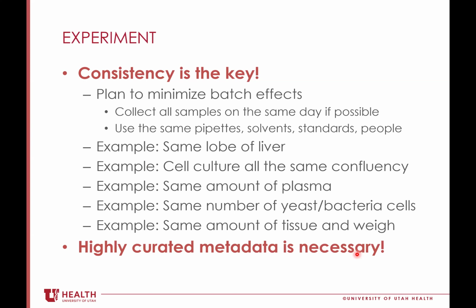And what we really want with all this is highly curated metadata. So make sure you talk to us first before you drop these samples off, and we should discuss all these key aspects of the experiment. We really need to know the exact amount of plasma you have given us and what's in the tubes, or the number of bacterial cells, etc. So this is the biggest key for a successful experiment: consistency and highly curated metadata. And really everything else kind of takes care of itself if it's a well thought out experiment.